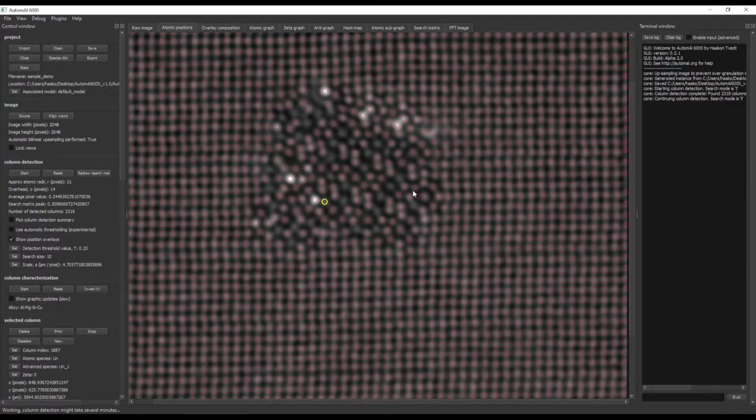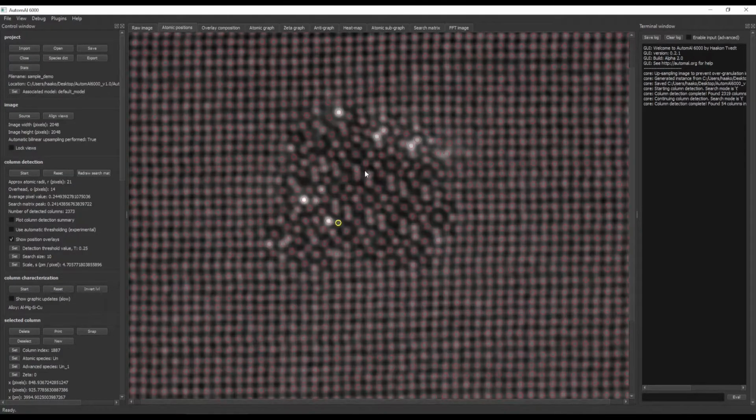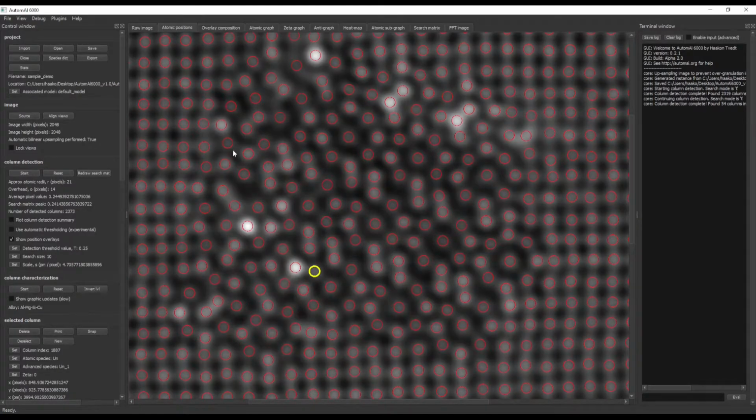And you know, this is a bit finicky. I think it's a bit annoying, which is why you might find it useful to use, for instance, AutomAl. So there we go. It says column detection complete, and this result has to be controlled. These edge cases here are not important, but it looks quite okay now. I cannot see any errors.